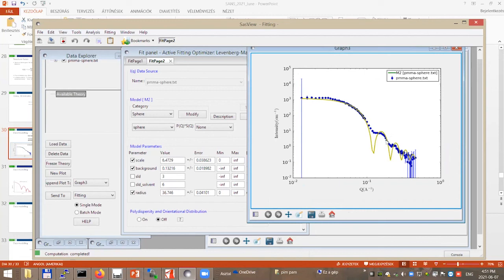This is the philosophical aspect of the problem, but the practical aspect is that the spheres are indeed not exactly the same and not exactly spherical, just because chemistry doesn't allow you to prepare such perfect spheres. So it means that the spheres are not the same, but still we can say that they are nearly similar.